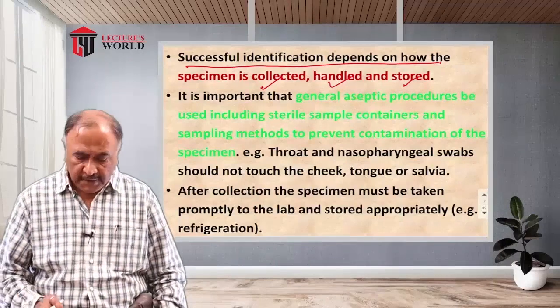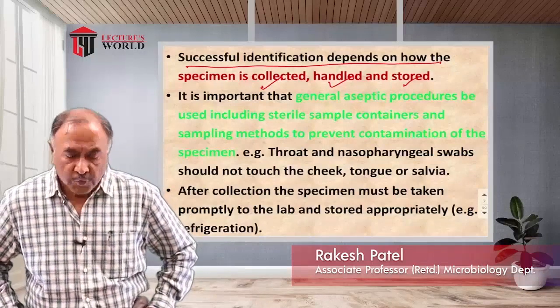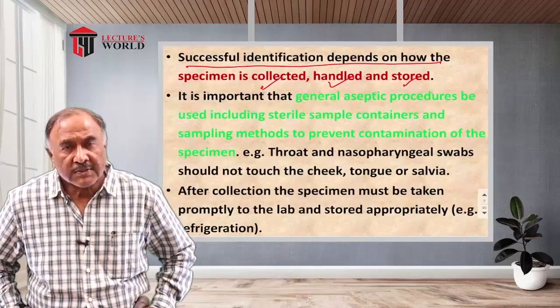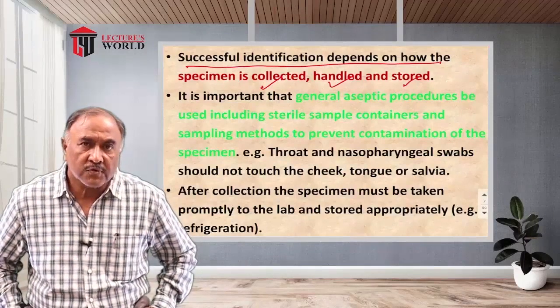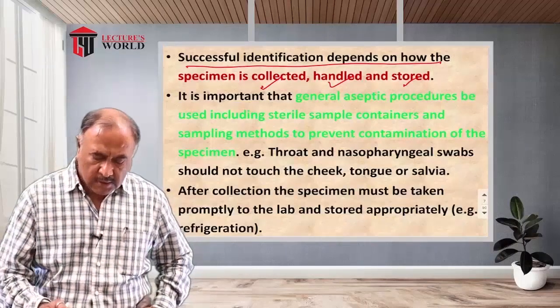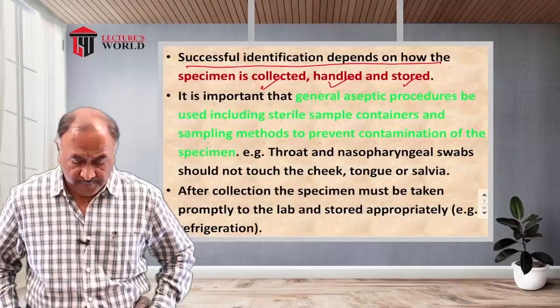Followed by gram staining. You know the gram staining procedure, we have discussed in detail earlier. Use of crystal violet as a primary stain, gram's iodine as a mordant, acetone or ethanol as a decolorizer, and use of safranin as a counter stain. This would lead to differentiation of bacteria when we observe them under the microscope.